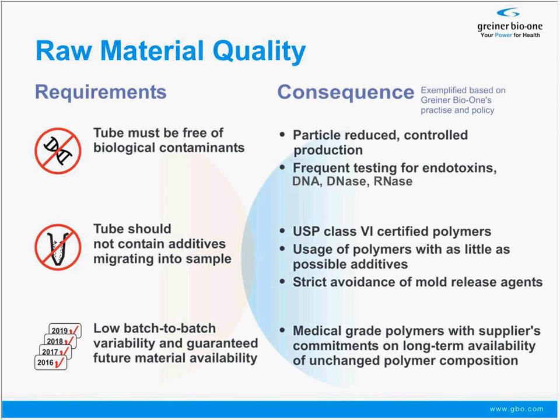And also there's a certain commitment of the supplier to the customer, in this case the manufacturer of the tube, in terms of future availability of the raw material. So if there's a plan to discontinue the raw material, then the customer, the producer of the tubes, will be notified in advance, something like 2 years or so, so that an alternative material with identical properties can be found.